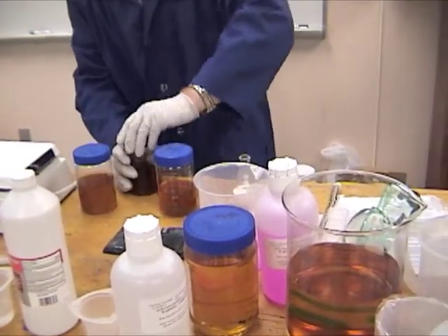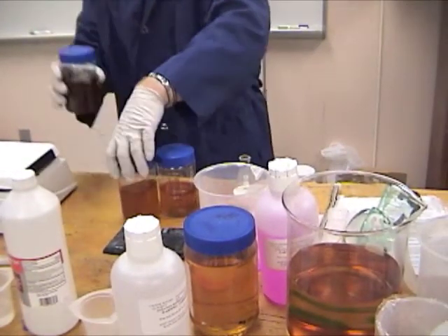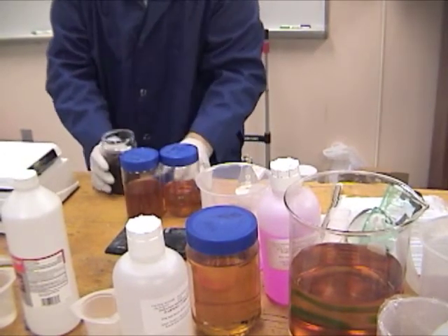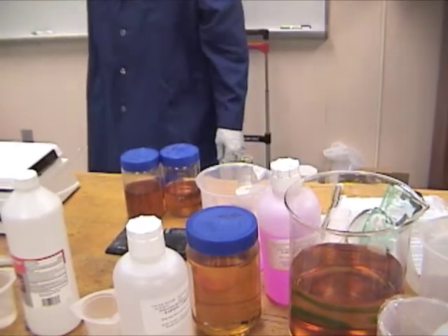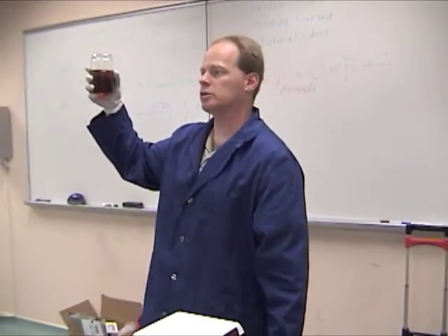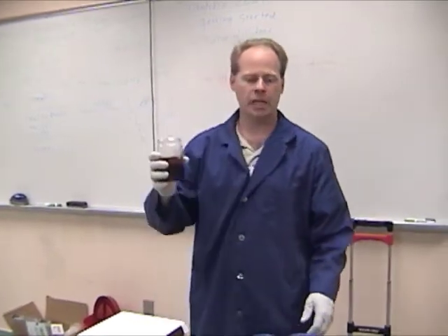I'm now going to add 1 milliliter of this mystery oil that we don't know what its titration is, or how acidic it is. So this is just like our volcano. This is our acid. This is the lemon juice, but we don't know how strong this lemon juice is, okay?